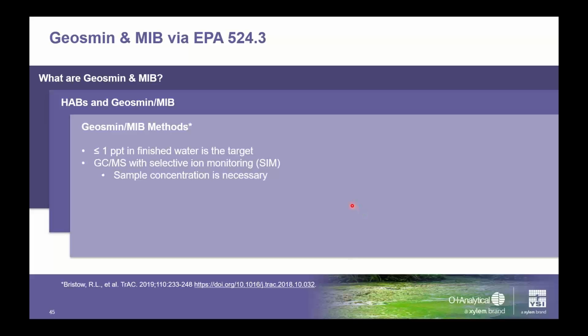Now, because humans can detect this at such low concentrations, we tried to come up with a method that can detect less than 1 part per trillion in finished water.